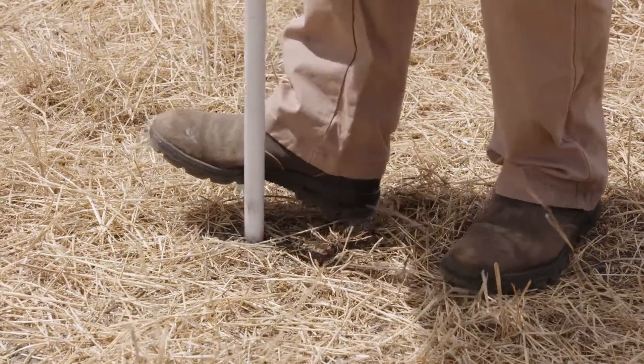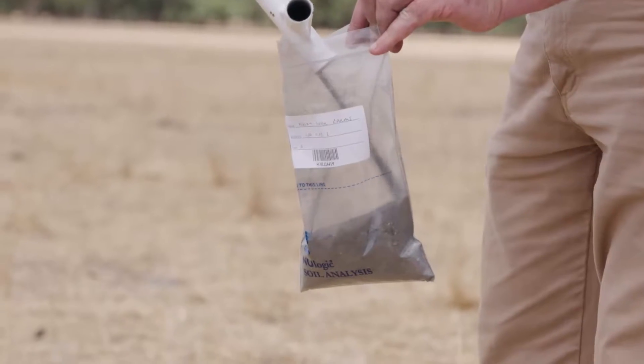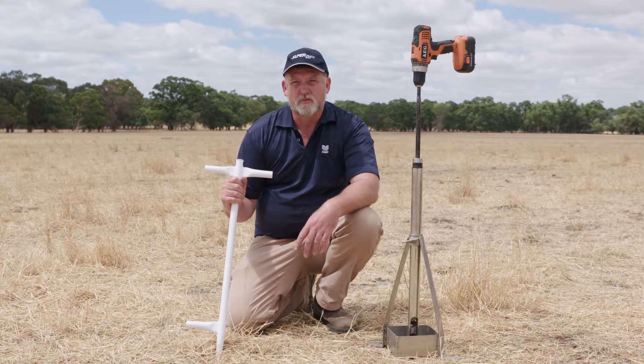You take the samples by pushing the device into the ground or drilling into the ground until you get the required amount of core samples to fill the sample bag up to the required line.